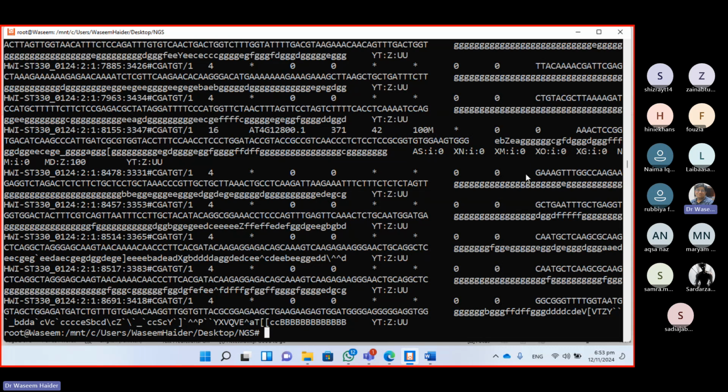You can also see if there is some mismatching. If some nucleotide is mismatching, only one or two mismatches are possible, so they are also reported. They are important to capture our SNPs, right? So those mismatches are also important. A couple of one or two, not more than 3 or 4 mismatches are allowed here, but those mismatches are also very important for us.